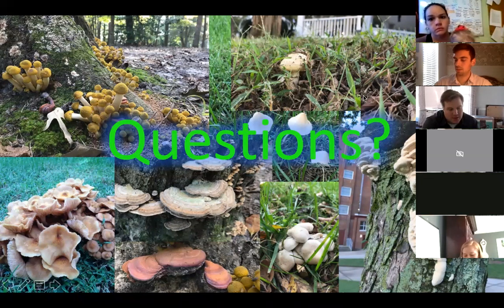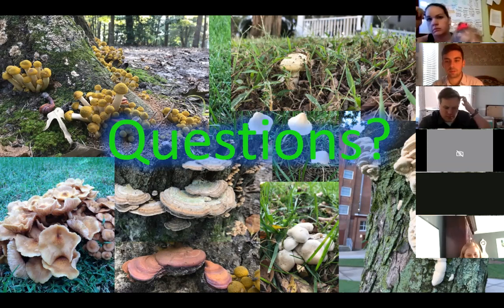Sure. Hi. Thanks. Nice talk, and beautifully presented in terms of the pictures in the presentation. It really was very easy to follow. My question has to do with the PCR gel that you showed. It may have just been an artifact, and it may have just been because it was a short view, but it almost looked like there was a doublet that you were amplifying in some of those lanes. I'm wondering whether that's really what the gel looked like when you looked at it, or was it clearly one nice, solid, beefy band?